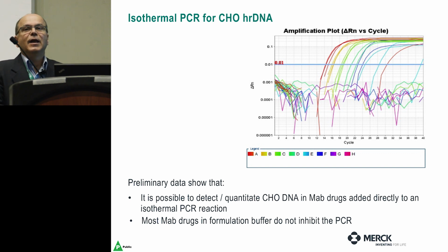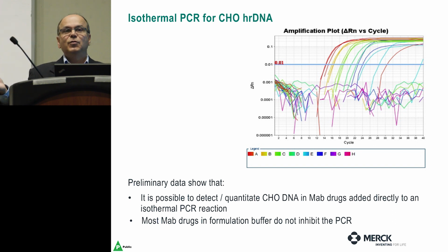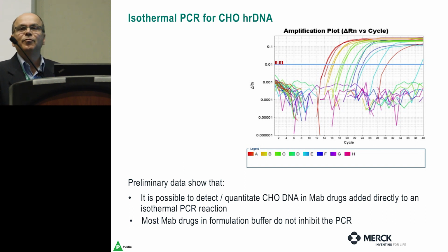The whole pain of making all these droplets and trying to figure out whether the droplets are positive or negative doesn't work. So if Bio-Rad were to develop an oil that will stabilize at, say, 60 degrees centigrade, then we will be able to do it.